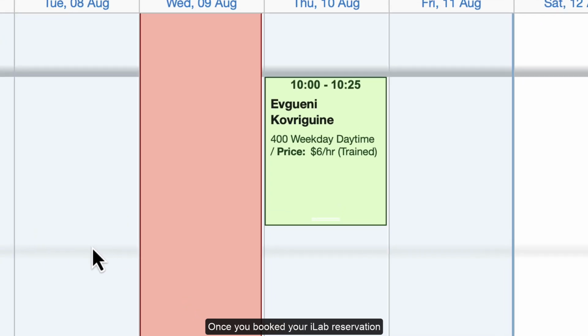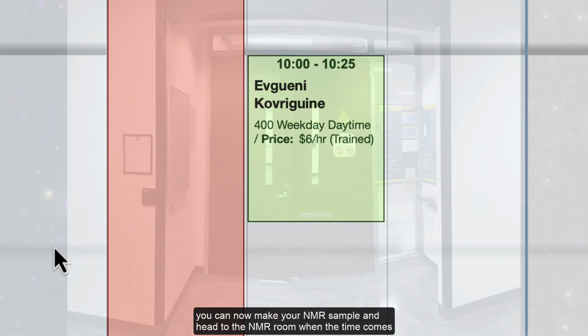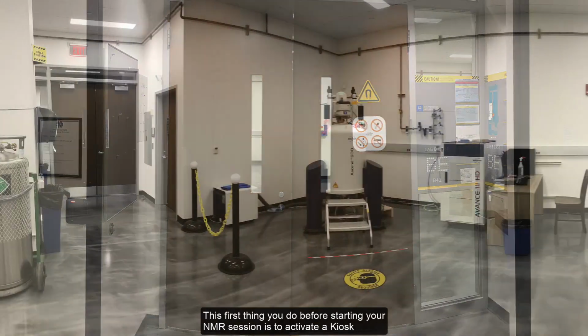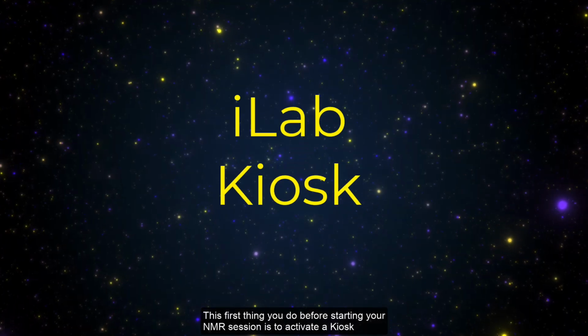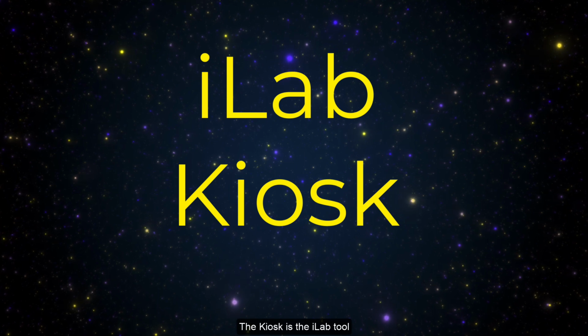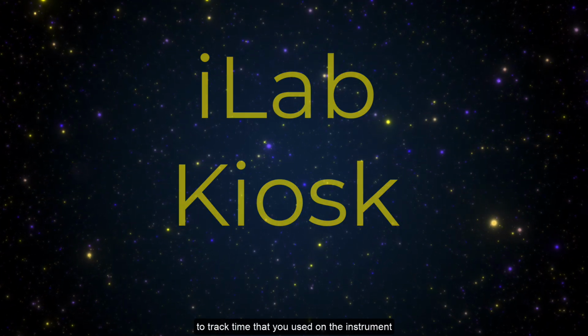Once you have booked your iLab reservation, you can now make your NMR sample and head to the NMR room when the time comes. The first thing you do before starting your NMR session is to activate a kiosk. The kiosk is the iLab tool to track time that you used on the NMR machine.